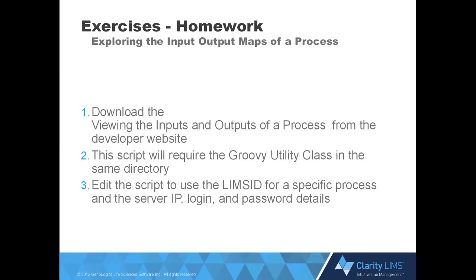And obviously you will need to edit the script for your LIMS in particular. So you'll need the LIMS ID of a specific process, and you'll need to give it the IP of your server and obviously the login and the password details. And we'll see running that script for real as an exercise in a separate recording.